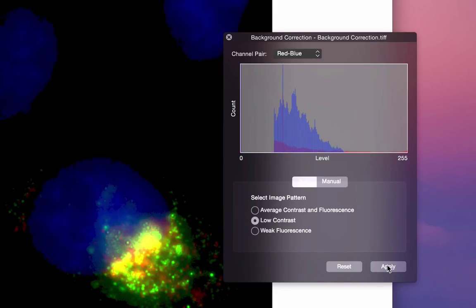After clicking Apply, the histogram in the background correction panel will update to indicate how your image has changed after applying correction.